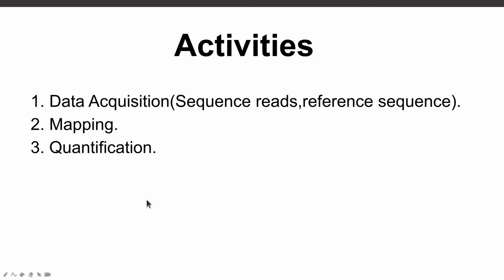Please take note that these three activities are part of a bigger workflow that is used for RNA-seq data analysis. And so this means that there is more to what I've indicated here when it comes to RNA-seq data analysis. But the focus of this tutorial is to show you how to quantify the reads, and that is why I have limited the activities to these three. Okay, so that's what you need to know.